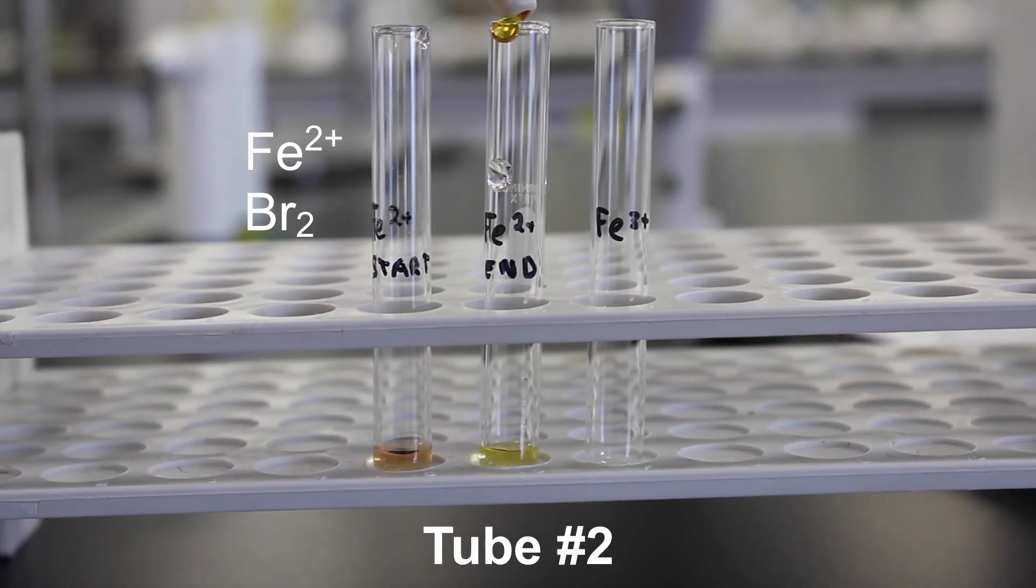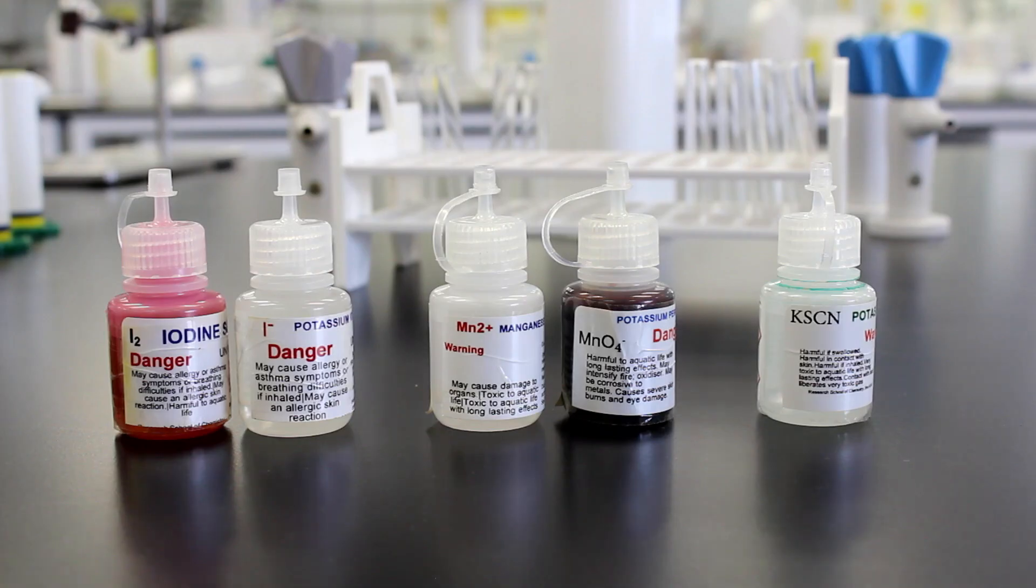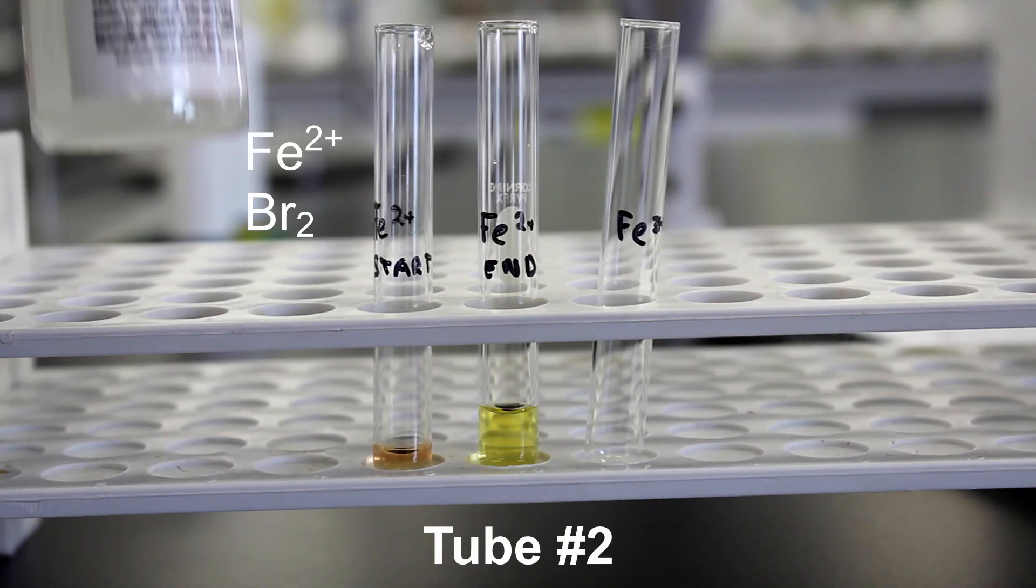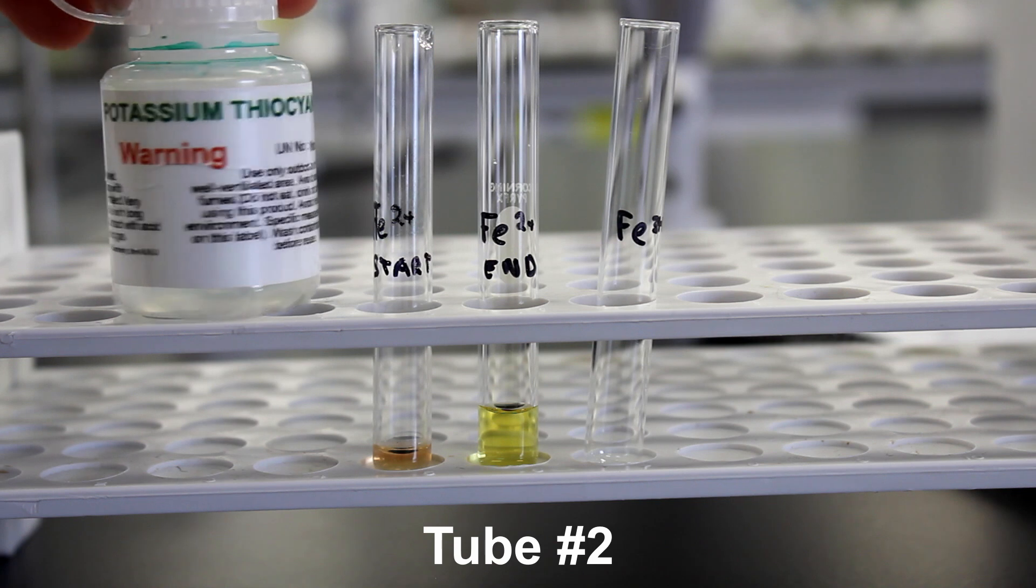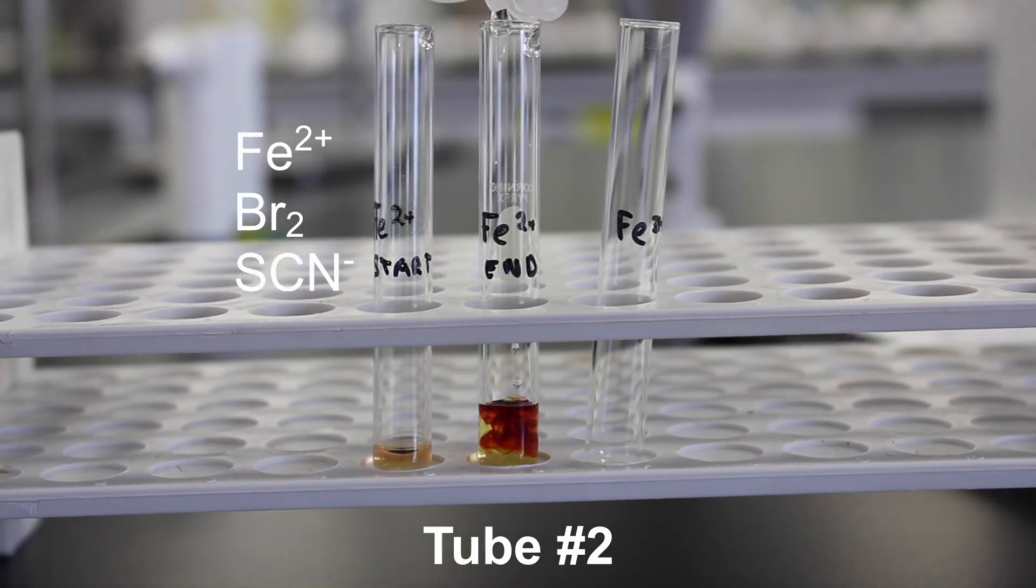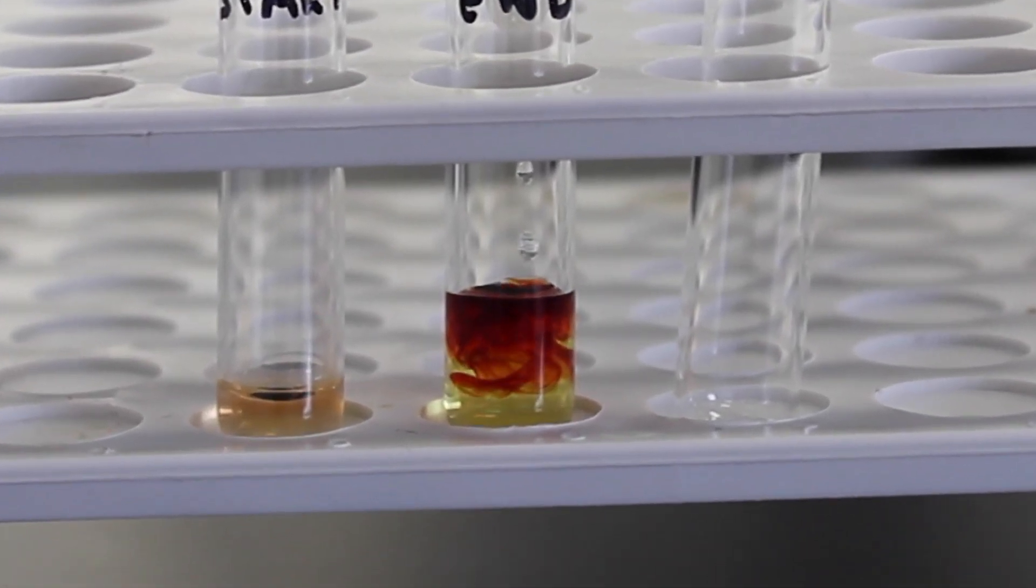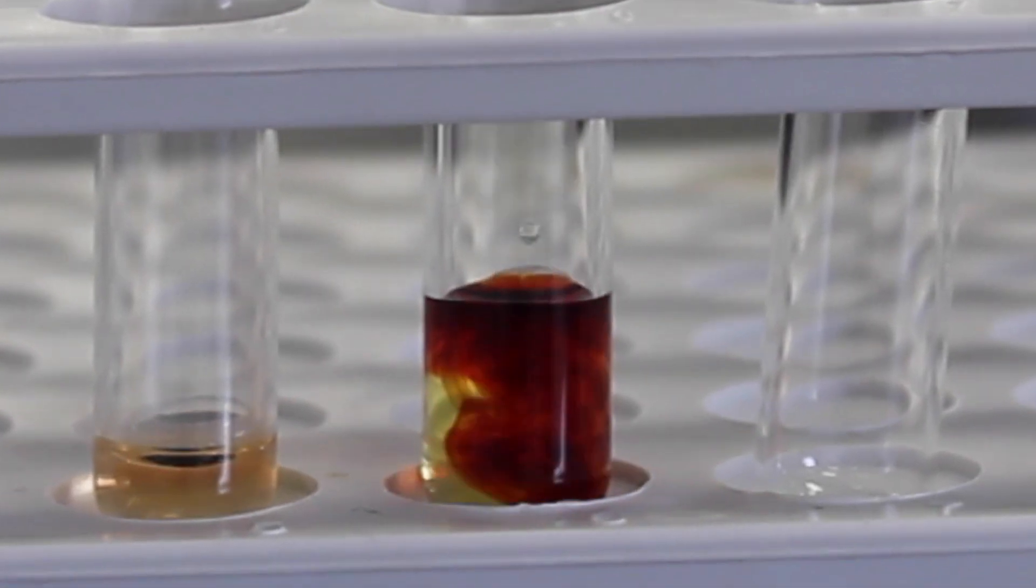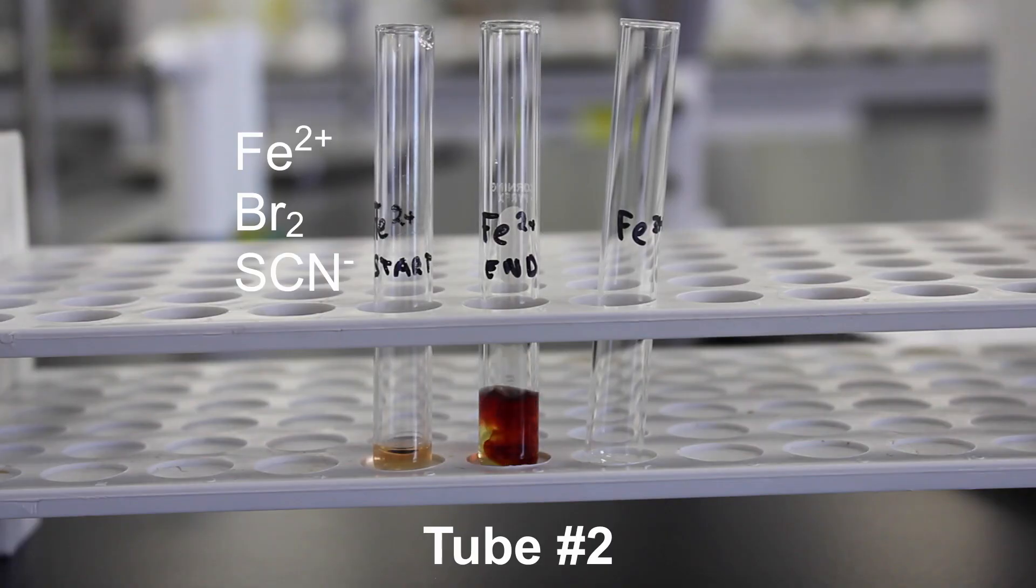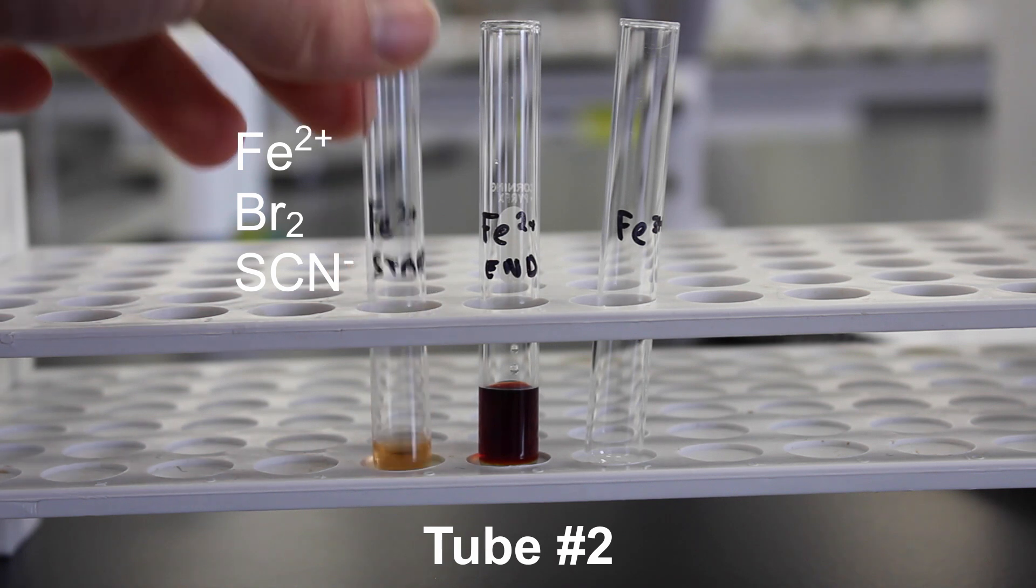Now we're adding in some bromine water to our test tube with iron 2+. When we add the potassium thiocyanate, the change in colour will indicate whether or not iron 3+ has been formed. As you can see, the solution has turned very dark red in comparison with our start solution of just iron 2+ ions.